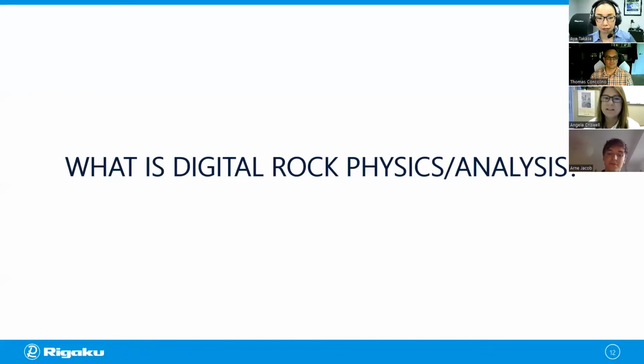Do you think it's the physics about digitally recorded rock music? Or maybe it's analysis of flow properties of reservoir rocks using image-based computation? Or do you instead think digital rock physics is CT image analysis of all types of rocks? So I'll give you a few seconds to answer before we share the results of this poll.